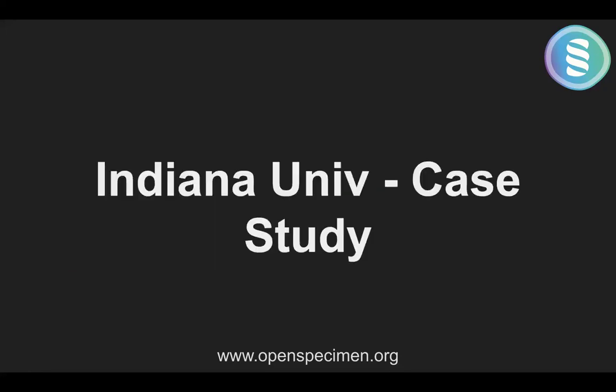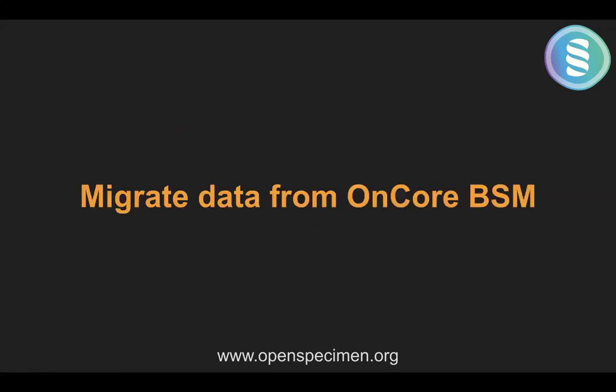So with that, I want to start with a case study of a recent implementation, something that happened in, say, the last year or so. Just to start with something interesting, a success story kind of thing. Even though this was a very big project, I don't want the takeaway to be that OpenSpecimen is used for very big projects and not suited for smaller projects. We are just showing this because this is a recent implementation.